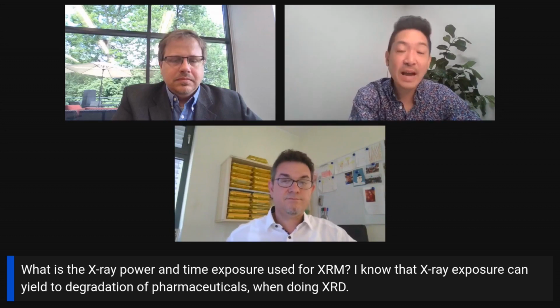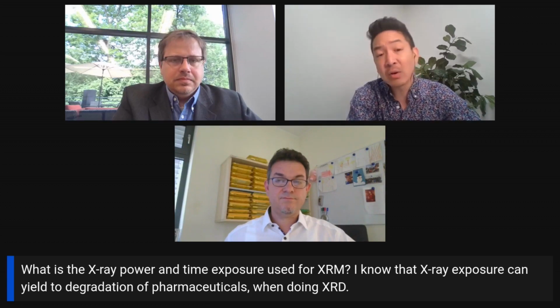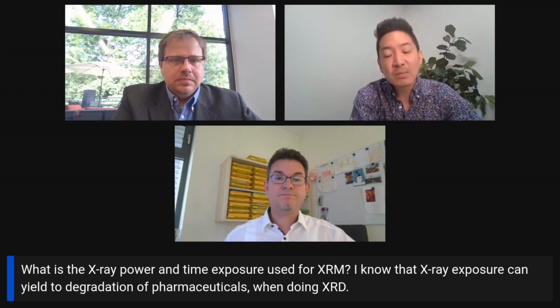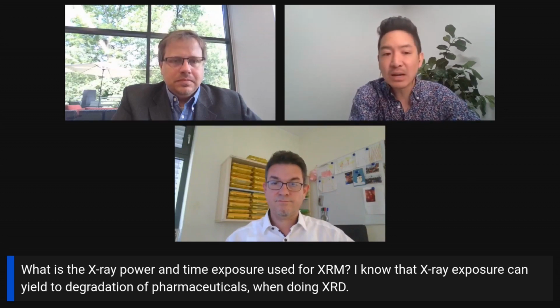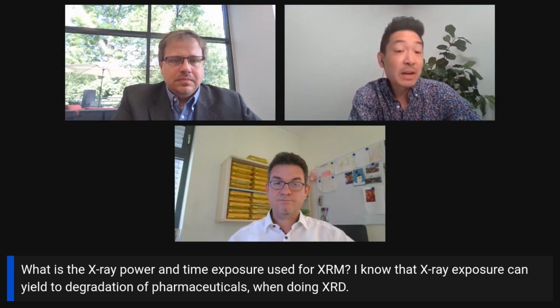And for anyone who's done anything on the radiation side of things, it's time and power. It's the length of exposure time. And so one of the things that is really cool about modern equipment is that data collection tends to be a bit faster because of advances in things like sources and technologies, like the motorized divergence slit. You can get through your data much faster before something negative might happen, like X-ray damage. But at least in a laboratory setting, I don't frequently see this on samples that I encounter.